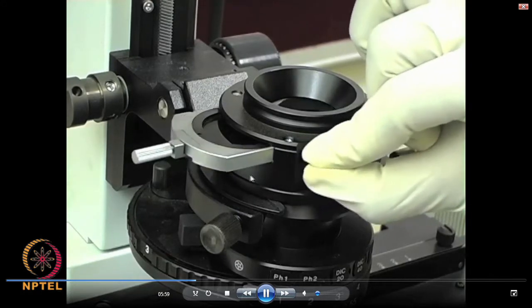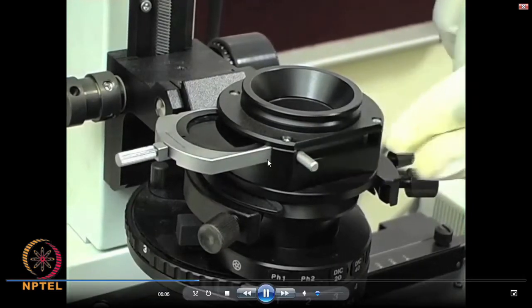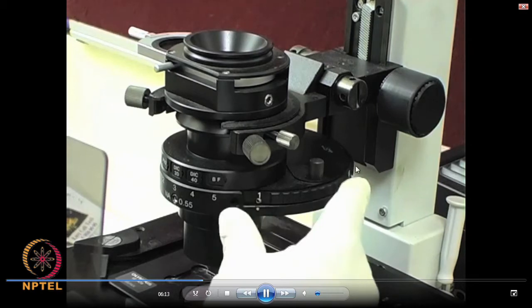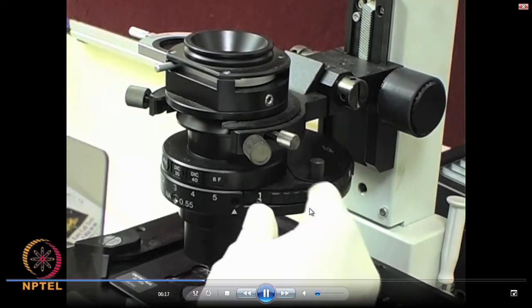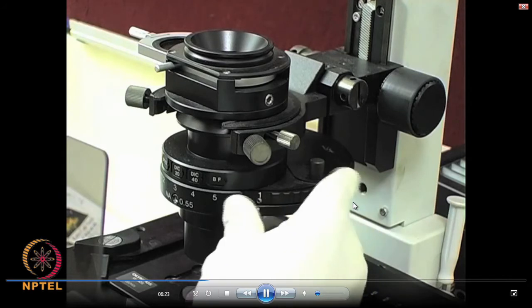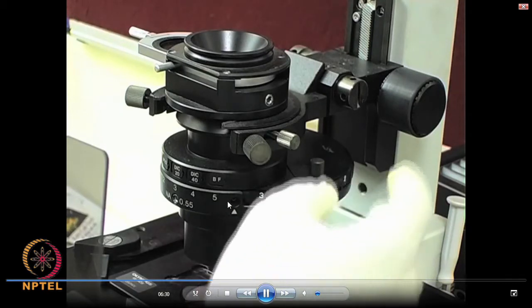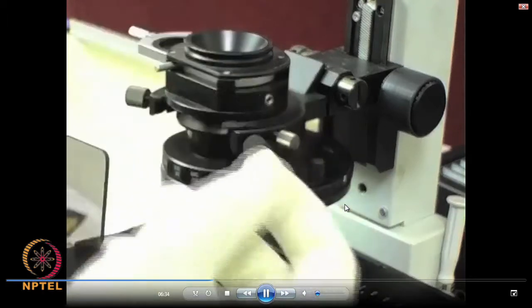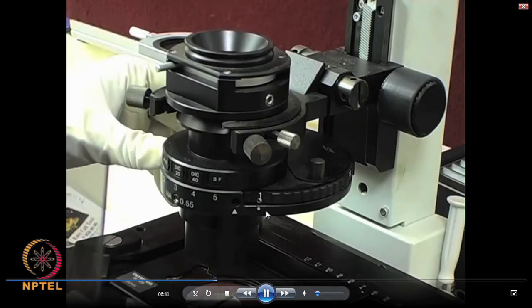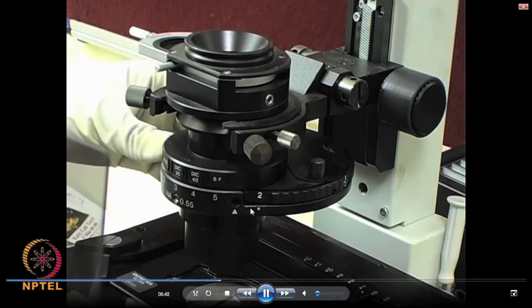What you are now seeing is a polarizer which is being engaged, and in normal bright field illumination you disengage this so that the path is kept clear for the light to pass through. And below, you are now seeing a set of condensers, filters and apertures belonging to different modes of operation. You can see that they are numbered 1, 2, 3, 4, 5 and so on. Depending upon the operation mode, you will turn this condenser and aperture to a particular slot, which is marked as a white dot here, so that you will be able to perform that particular operation.